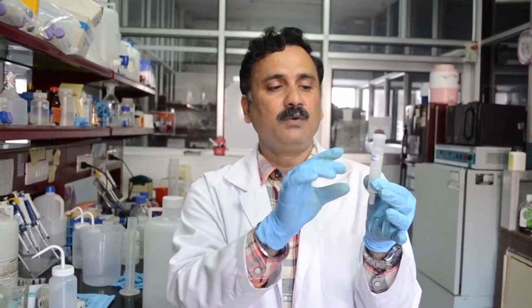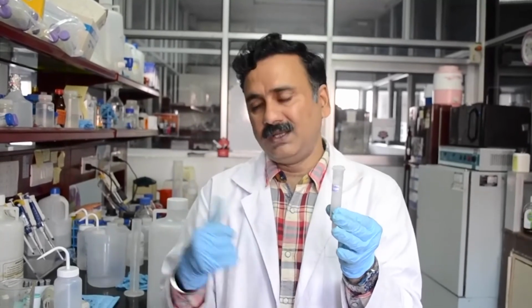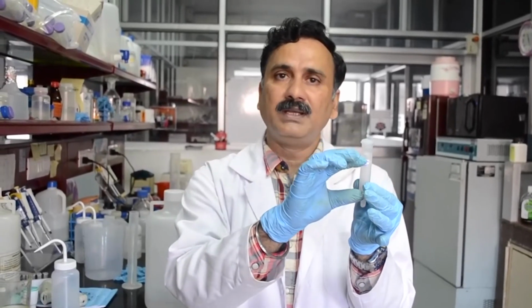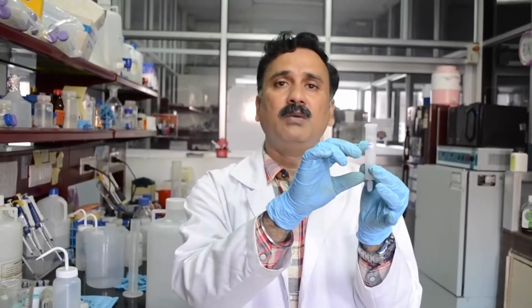First, we have to equilibrate this column with the solvent in which you are interested in doing the buffer exchange. In this case, we are trying to desalt the protein, so we are going to equilibrate this column with water, then load the protein into this column and start collecting the fractions.